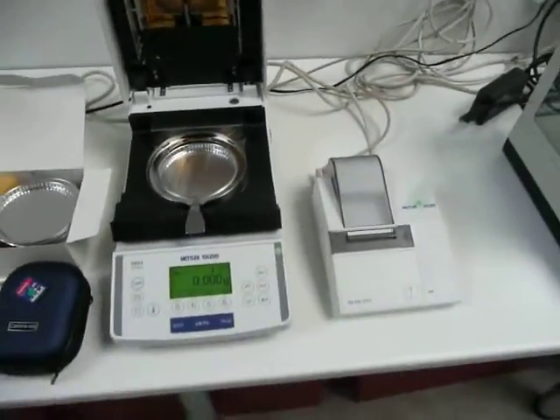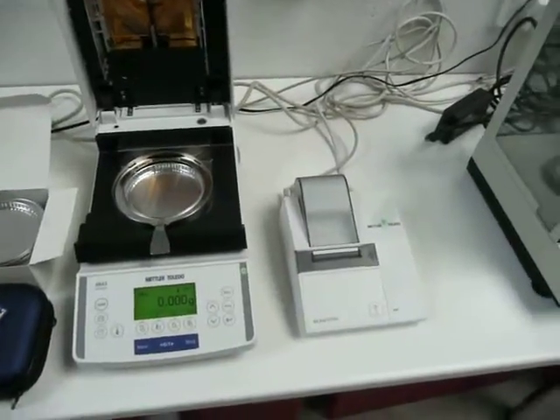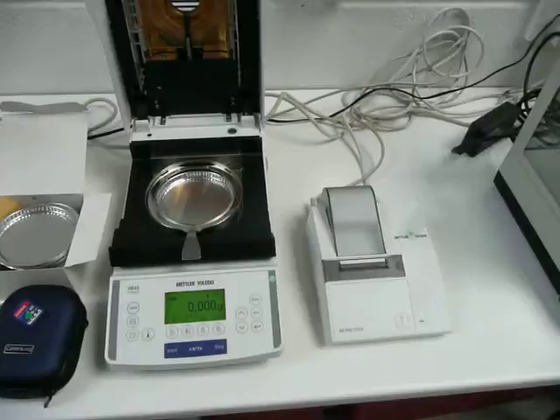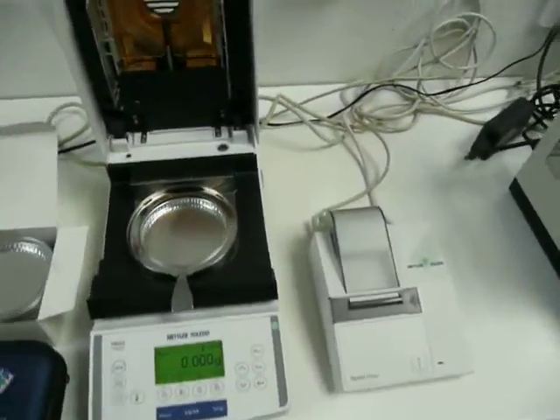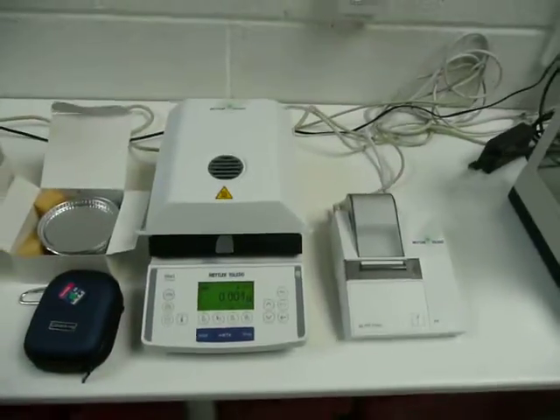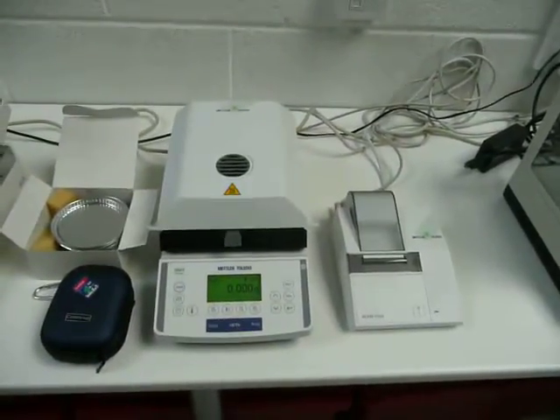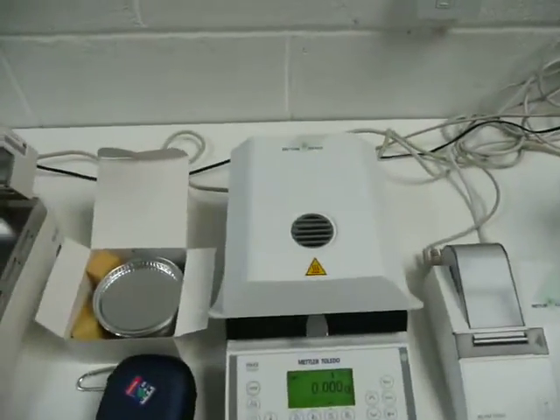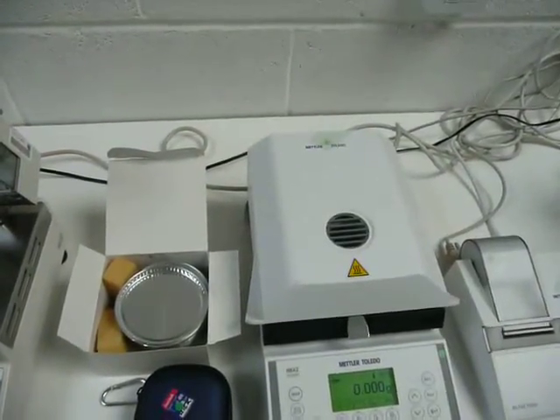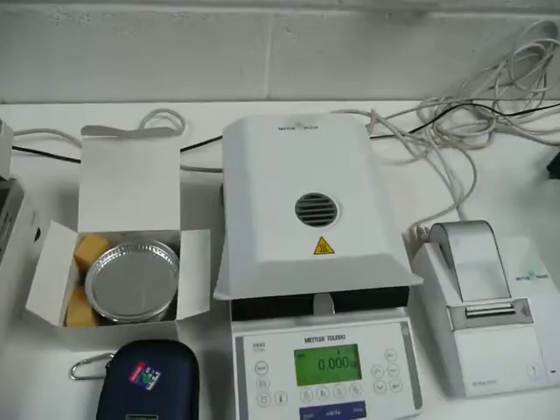Moving on we've got a printer, a Metlar Toledo printer coupled with an HB43 halogen moisture balance. Just have a quick look at this as well — this is in really good order, and some spare aluminium weighing receptacles as well with that.